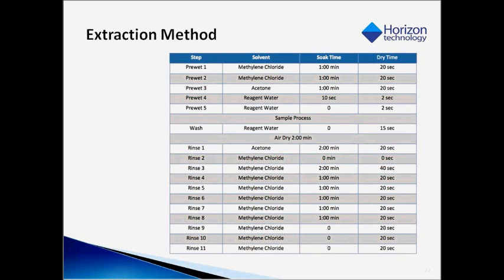This makes certain that any PAHs sticking to the inner glass bottle will be transported to the disk and eluted with the other analytes of interest. The disk is finally rinsed to ensure a good transfer of the PAH into your collection vessel.